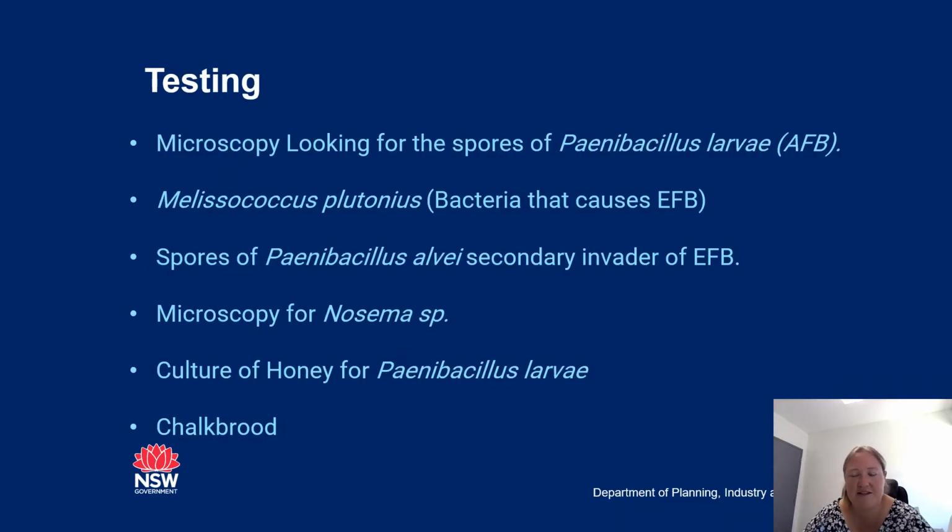So as I said, testing in our microbiology lab includes microscopy when we're looking for the spores of Paenibacillus larvae. We're looking for Melissococcus plutonius down the microscope, the spores of Paenibacillus alvei, which is the secondary invader of EFB. We do microscopy for Nosema species. We do culture on honey for Paenibacillus larvae. We do check comb for chalk brood.